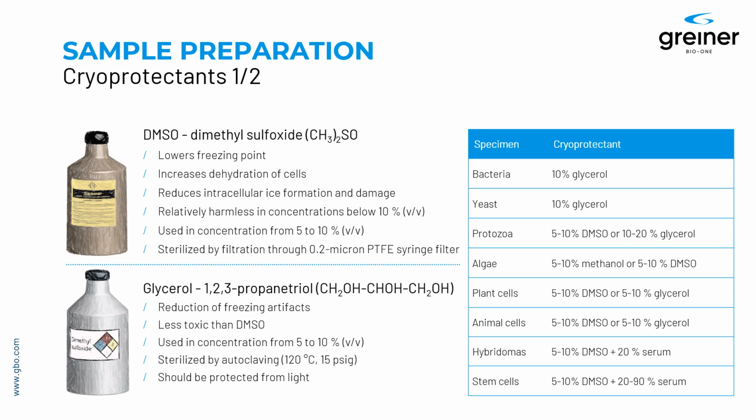On the other hand, there's glycerol, which is reducing freezing artifacts. It's less toxic than DMSO. It's used in the same concentration range from 5 to 10%. It is sterilized by autoclaving because it's a very viscous solution, and it should be protected from light.